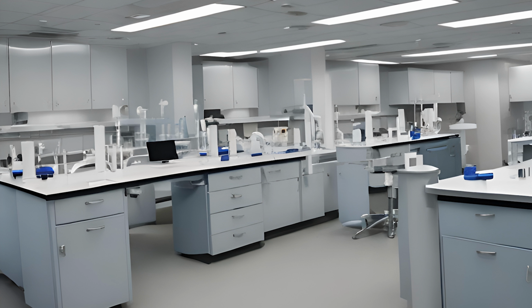Your lab will also have an ergonomics program. There are several areas of occupational risk to develop musculoskeletal disorders in the clinical lab, because some people will hunch over when they're at a microscope, having an awkward posture, causing strain on their back or their knees. I mentioned it before, but repetitive motion is a big one for the laboratory, and the repeated use of force. CAP requires accredited labs to have a comprehensive and well-defined ergonomics program to prevent these kind of injuries and disorders. The idea is that you prevent them. You don't treat them, you prevent them in the first place.